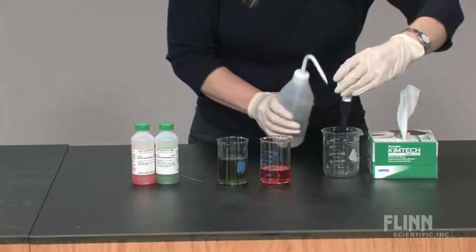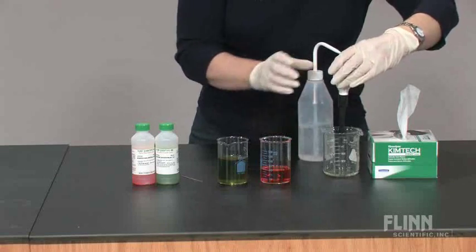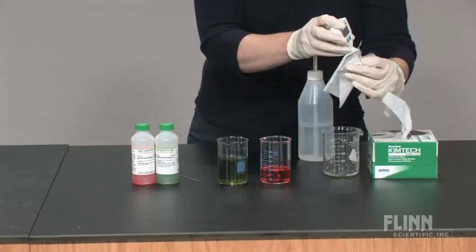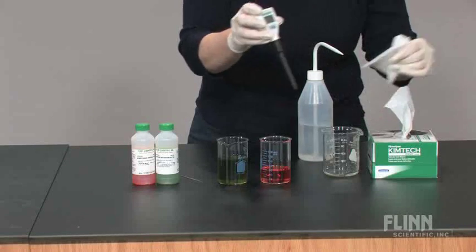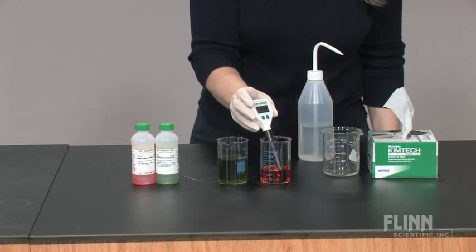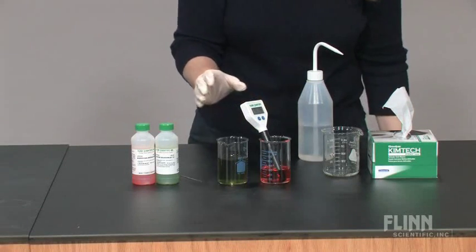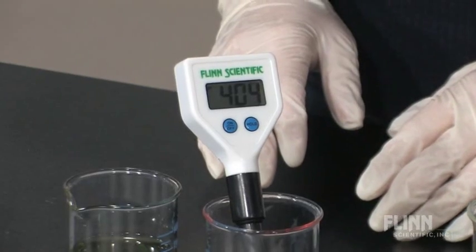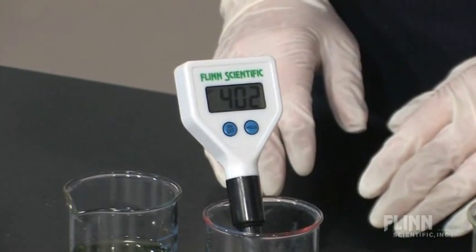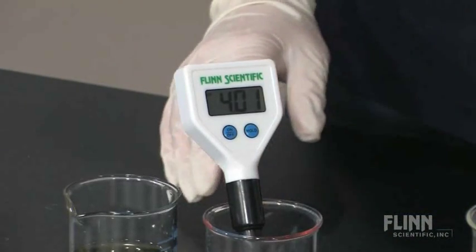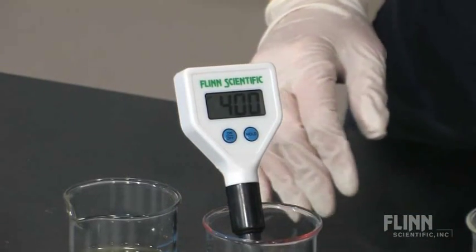Rinse the electrode with distilled water and blot dry. Immerse the electrode in pH 4 or pH 10 standard buffer solution. Once the display stabilizes, which may take approximately one minute, remove the pH meter from the buffer solution. Always use fresh buffers for calibration.